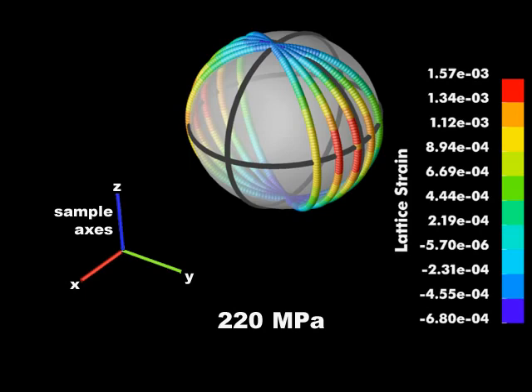By combining measurements along many different scattering vectors among multiple pole figures, we obtain a detailed picture of how the macroscopic strain is partitioned among the grains during deformation. Overall, diffraction experiments performed under in situ loading provide researchers with a highly effective tool for assessing the micromechanical state of a polycrystalline sample, as well as its evolution with deformation.